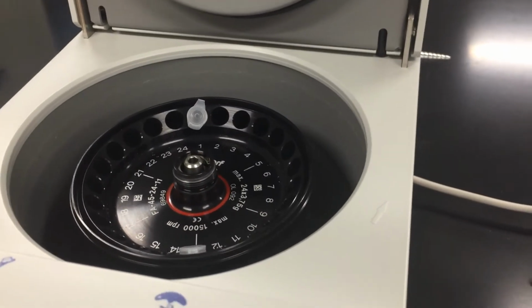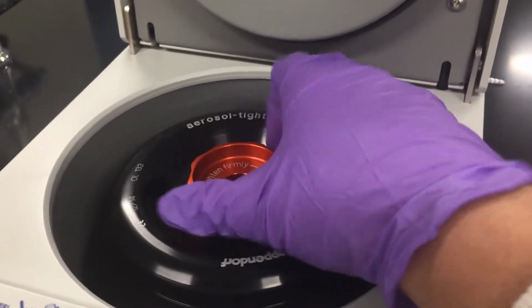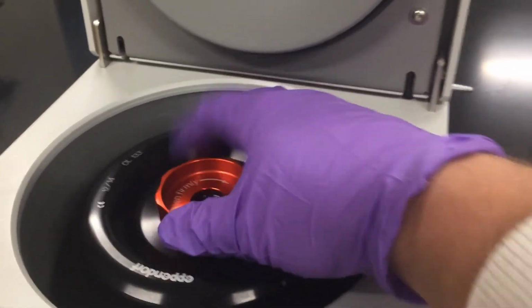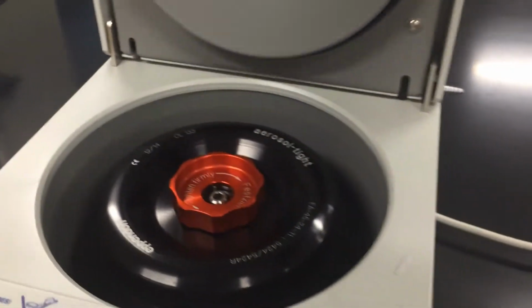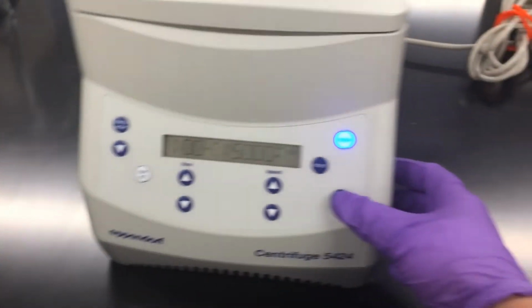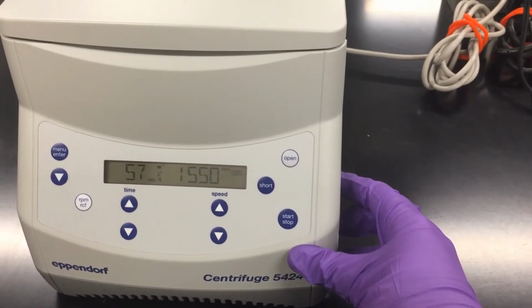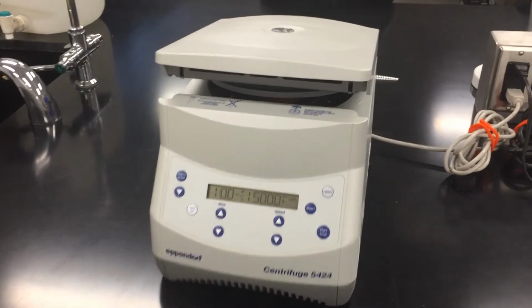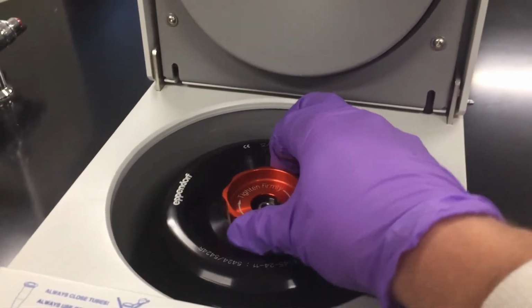It's very important when you're centrifuging that you do balance the centrifuge. This lid is going to go on. I'm going to fasten it so it's finger tight, and then we are going to hit start. The microfuge just finished and the lid popped open. Let's take a look at our samples.